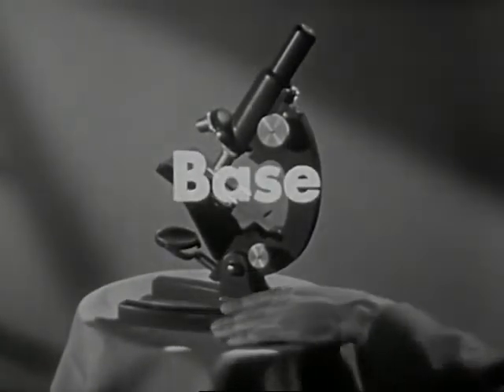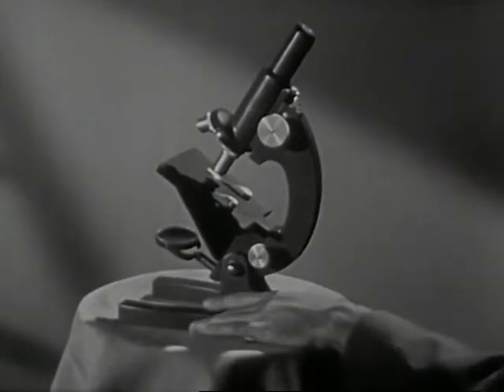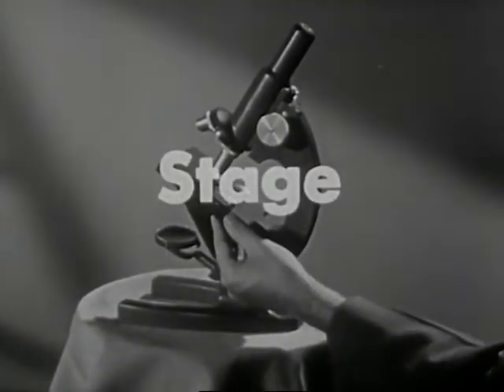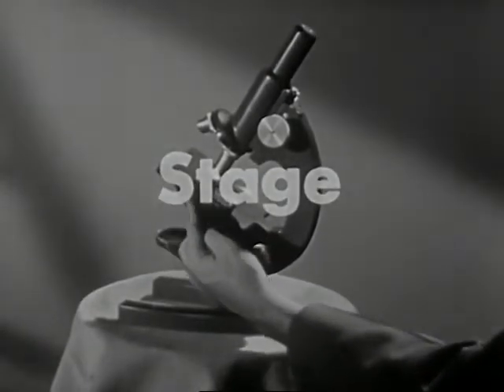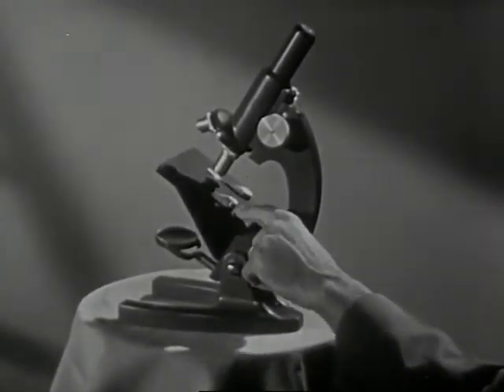The base is so named because it supports the microscope. It is fairly heavy to make the instrument stable. The stage may be compared to the stage of a theater. It holds the specimen to be viewed, and therefore is where the action takes place.